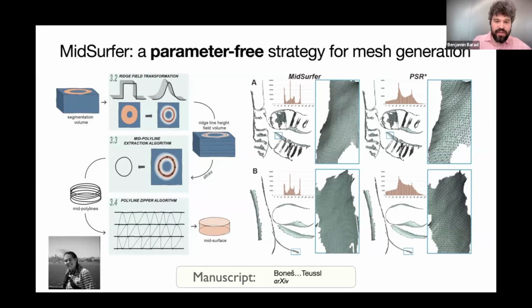So I had an opportunity to collaborate with a group earlier this year, and they had this idea, and I was incredibly impressed. In basically a month, they were able to come up with a better algorithm that now is completely parameter free, and makes smoother, better surfaces. And so in the very near future, we're adding this to our workflow. We've been testing it already, and hopefully that means that going forward, you'll need a lot less prior knowledge to start using our tools.